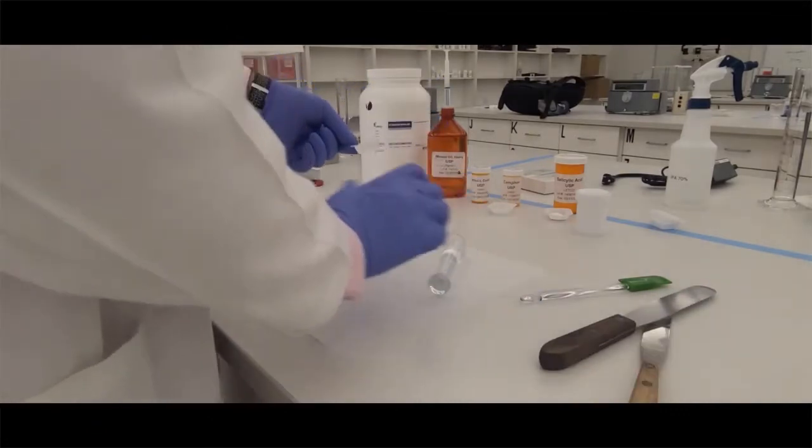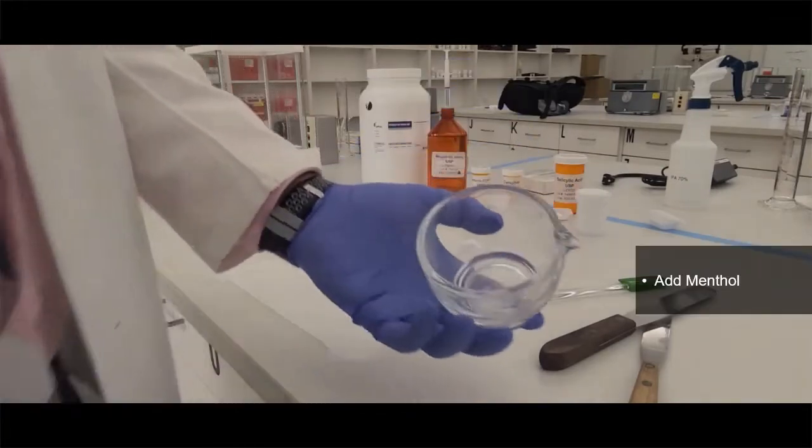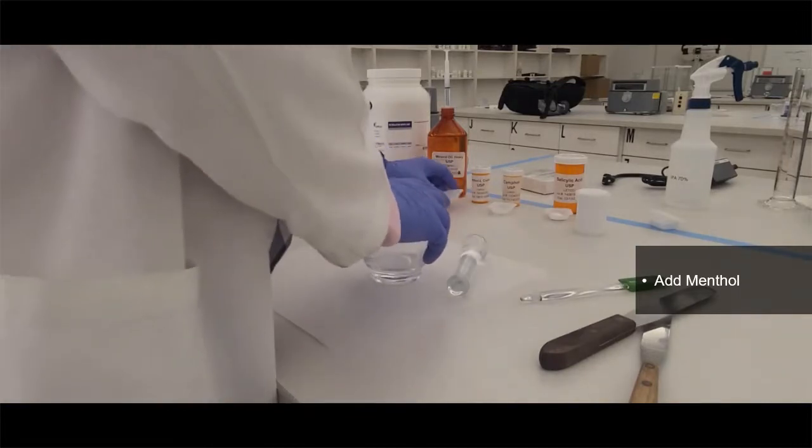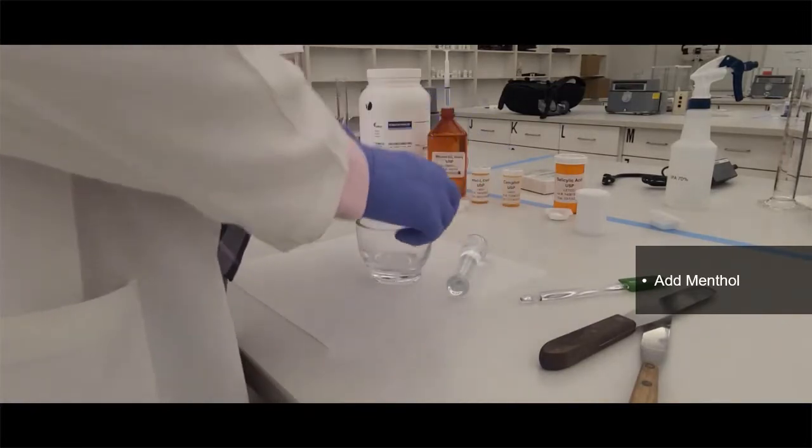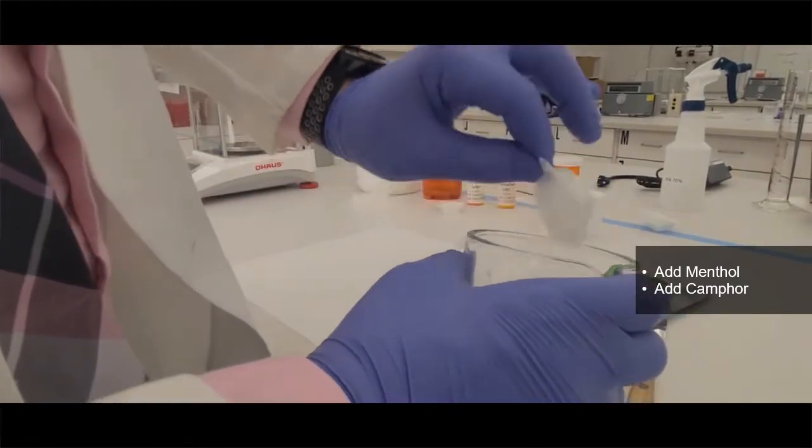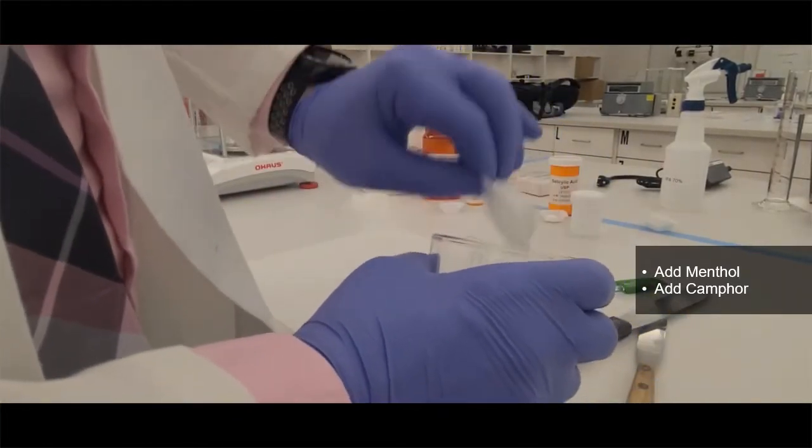And then with our clean glass mortar and pestle, we're going to first put in the camphor and menthol. So first I have in here menthol. You'll notice it's a very crystalline material. And then next I'm going to add in the camphor. The camphor is almost like a waxy sort of material. So these are very hard to crush down and make into fine powders.